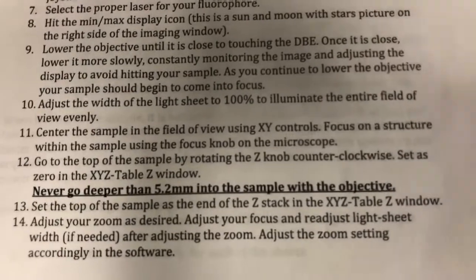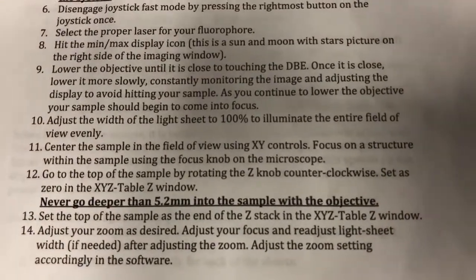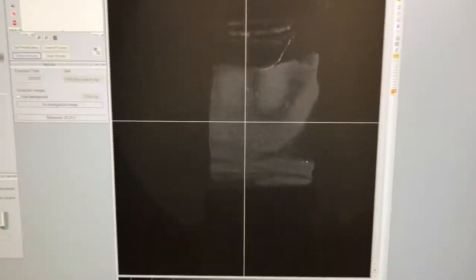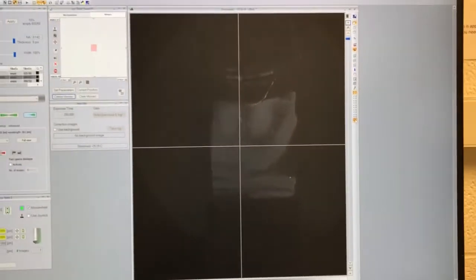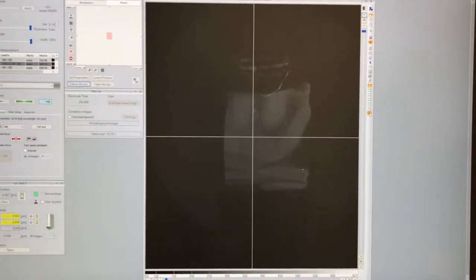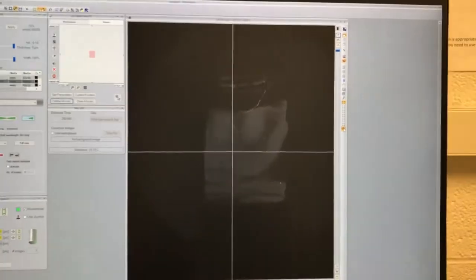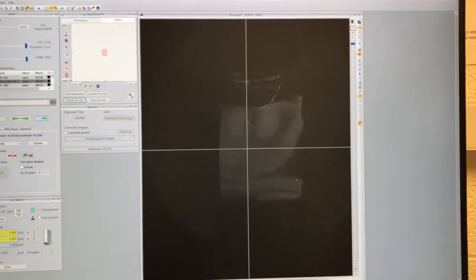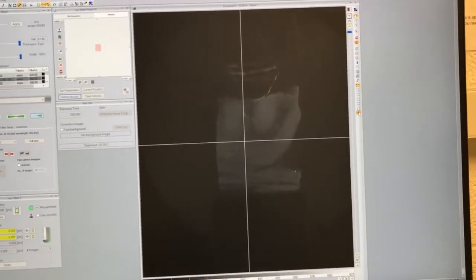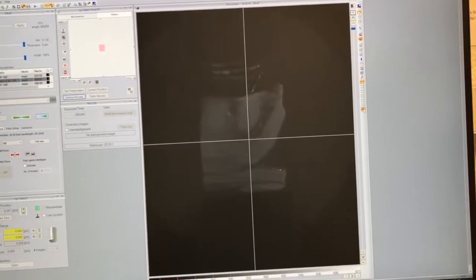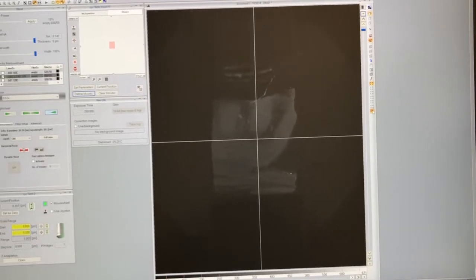Step 11: center the sample in the field of view using the XY controls, and focus on a structure within the sample using the focus knob. I find it very useful to put on the crosshair overlay so we can see the middle of the field of view. On a light sheet microscope, the middle is where you have the best image quality, so it's really important to center the sample. I'll move in X and then Y until it's centered.